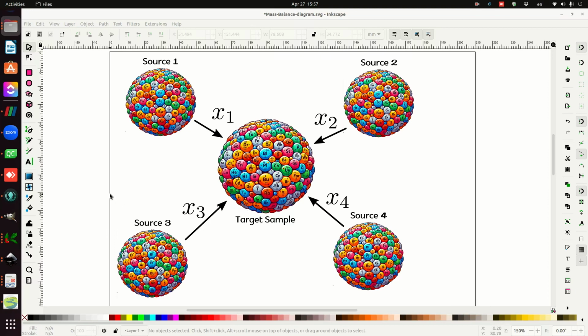Hello everyone. In this video I would like to show you how to prepare data files that are needed for the SedSat3 tool to perform sediment fingerprinting. This is going to be a video series, so I'm going to keep on posting videos on other features of SedSat3. In this particular video, I just want to focus on data preparation and then loading the data into SedSat and checking your data to make sure that it is what you want.